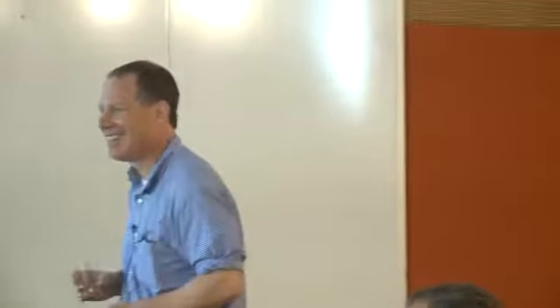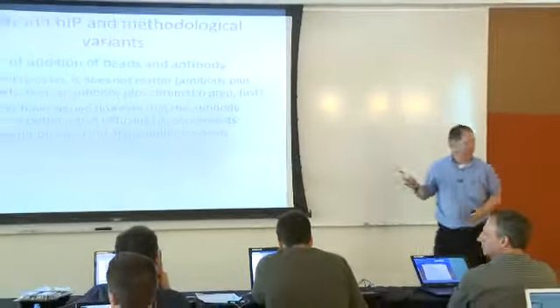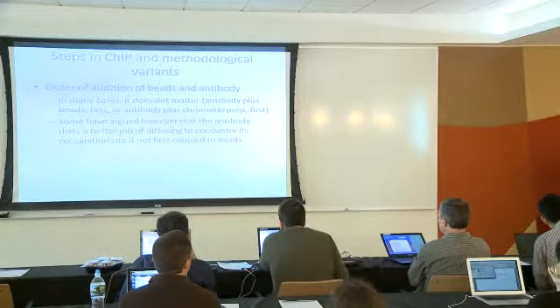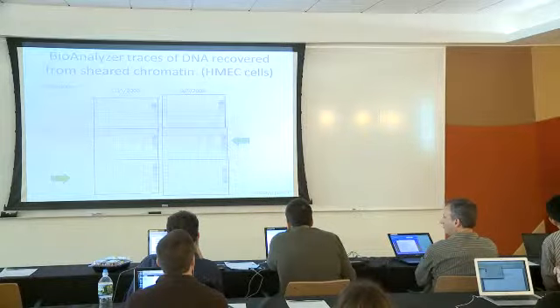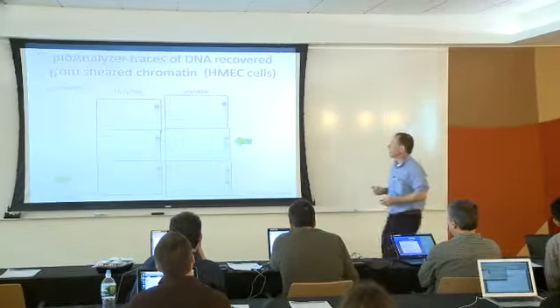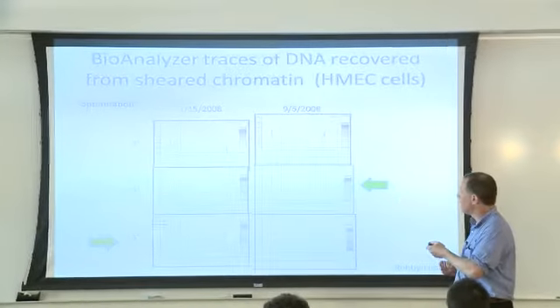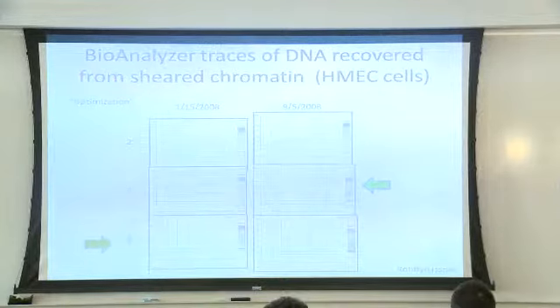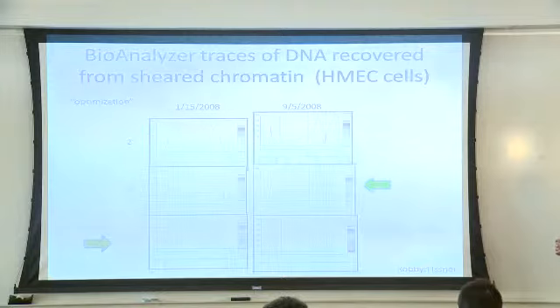Yes? Sorry, was that fragmentation profile generated by what system? I think I need to go back a slide here. You're asking me about this slide? Okay. This work done in 2008 was probably done using the Diagenode Bioruptor system, just based on the date. Robin provided these slides to me, and I didn't have a chance to ask her that question. This was before I even worked here, so I don't really know.